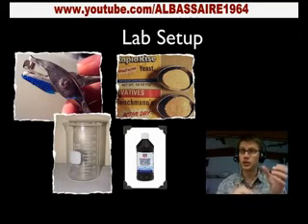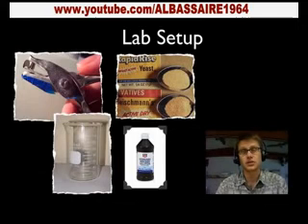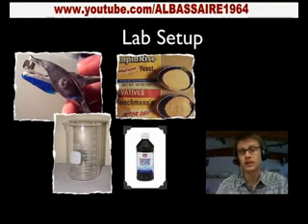And so we can put a number of discs in there, and then we can measure the rate just by the time it takes for it to float to the top, by measuring the amount of oxygen that's built. In this lab, our independent variable then is the concentration of the enzyme. In other words, how much enzyme is actually added to that disc. We then measure the rate, and so the faster that disc floats to the top, that implies that it is a faster rate. In other words, the smaller the distance, or the smaller the time is, the faster the rate.